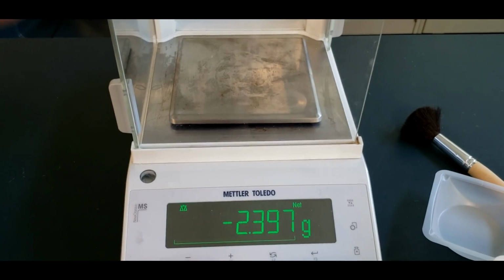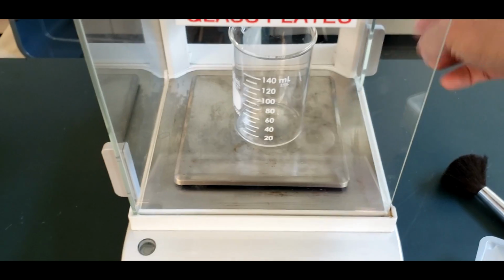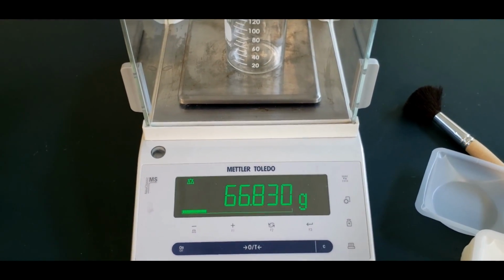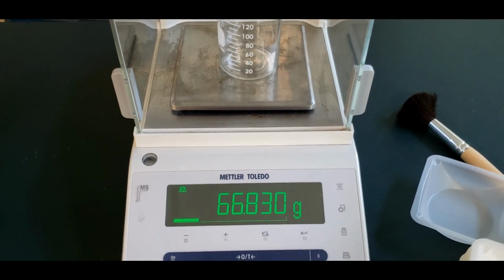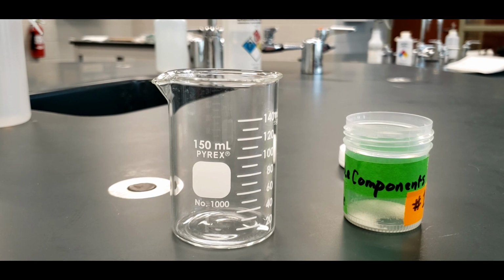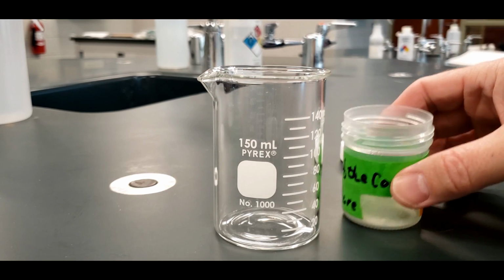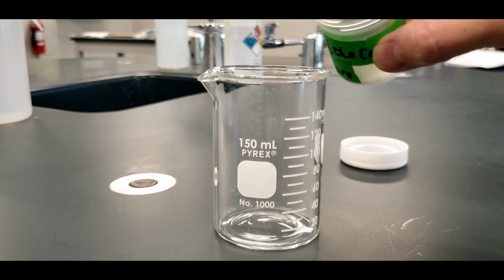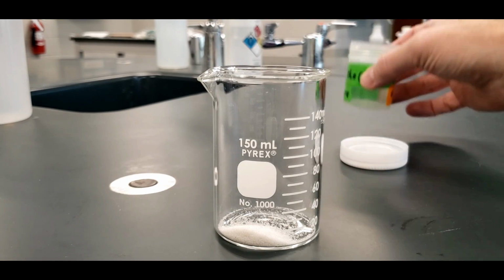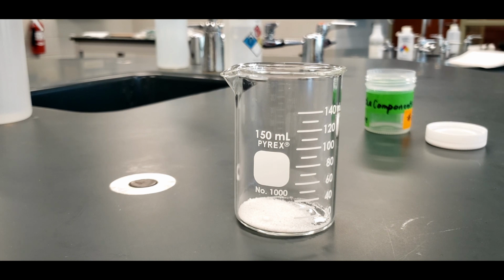We will weigh the beaker, the 150 ml beaker. So zero it. That's the mass. And because this was made up especially for this lab, here's the only lab technique we need to have for transferring the unknown. Normally it's a little more involved. That is the amount that we were given. That goes into the beaker.